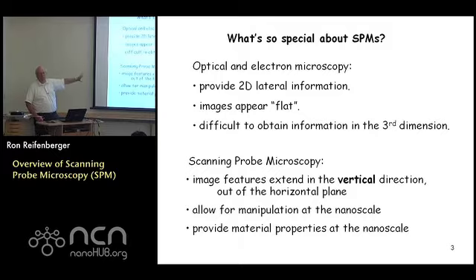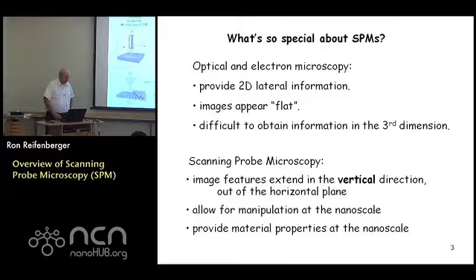Right, so the scanning probe microscope very nicely fills out a region of space in science and engineering that was left open by these more traditional microscopes. Okay? So that's what makes the scanning probe microscope so special.